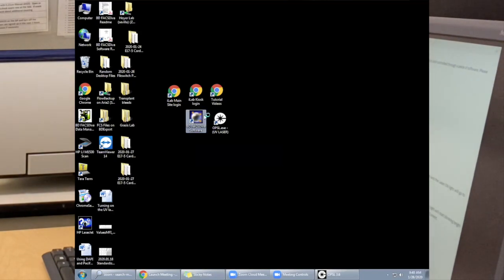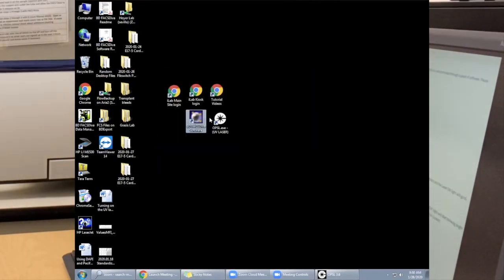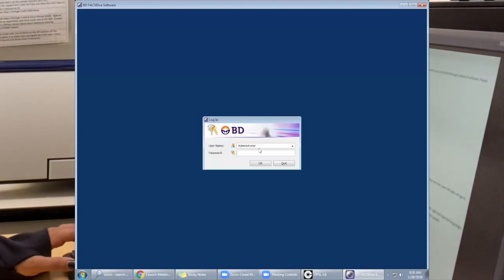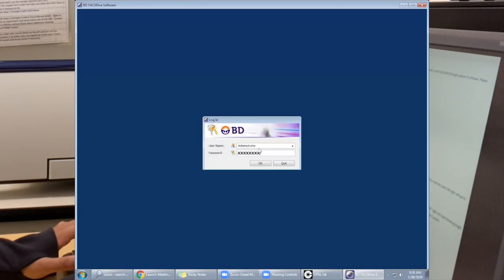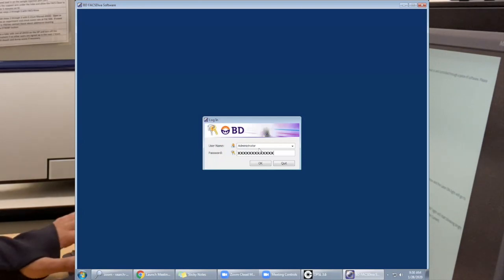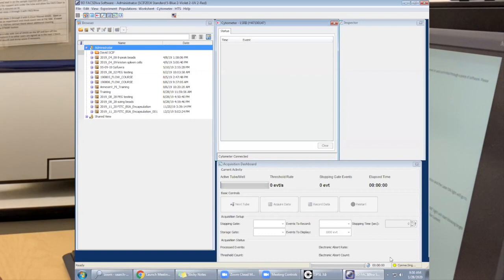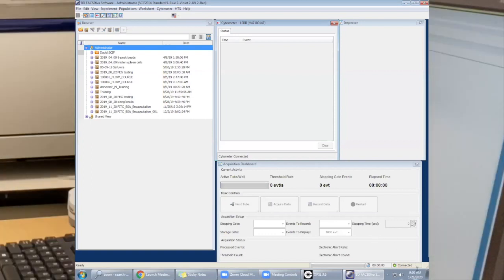The next thing you want to do is to go into the Diva software. From here, you'll log into your account. Once it says connected, you're good to go.